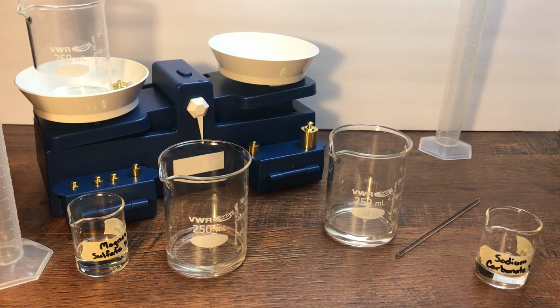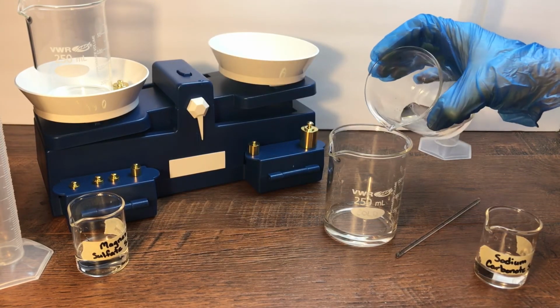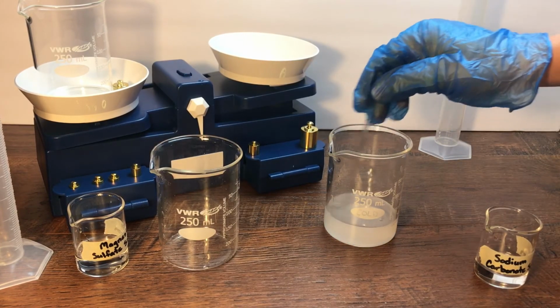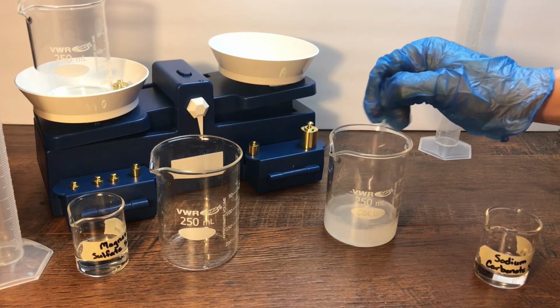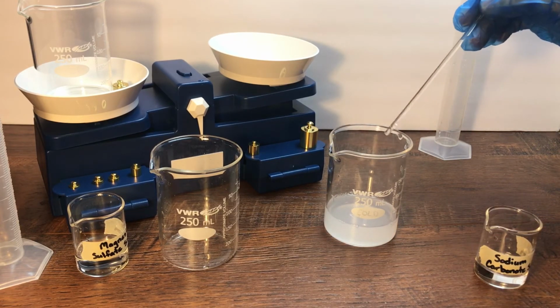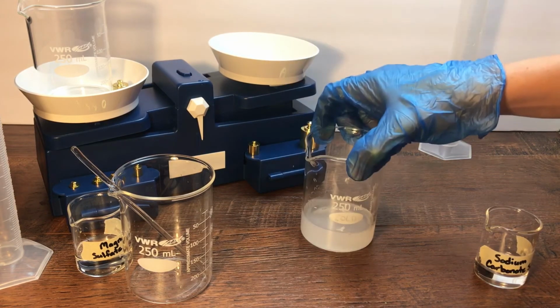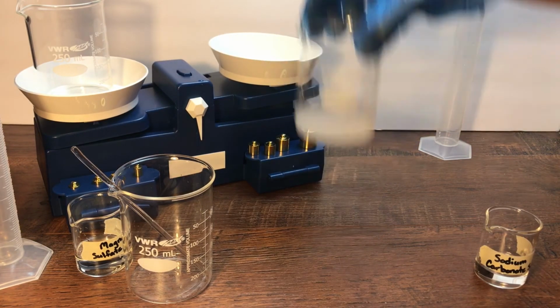So now I'm going to pour the magnesium sulfate solution into the sodium carbonate solution. And we'll mix those together so they're nice and combined. And now let's take the mass of our new solution. First, let me clear my balance. All right.